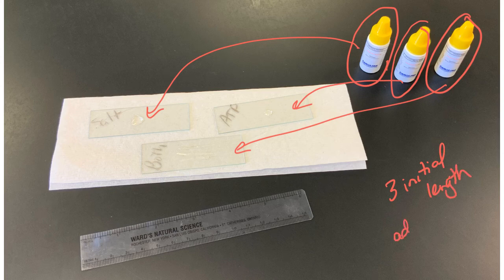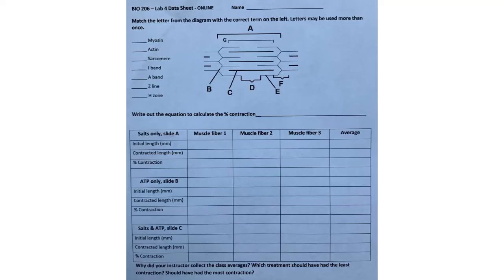Then you would have added solution, waited like a minute, 30 seconds. Once you get to 30 seconds, it doesn't matter. And then you would have remeasured the fibers to see if they contracted or not. Okay, so somebody would have taken that slide and remeasured the fibers again, all of which you would have put on a data sheet.